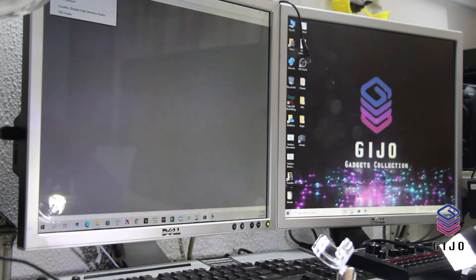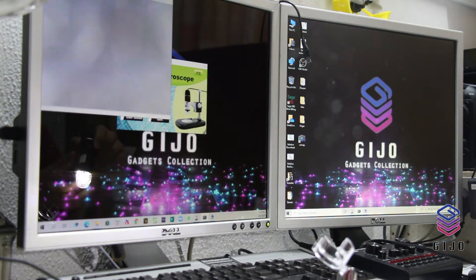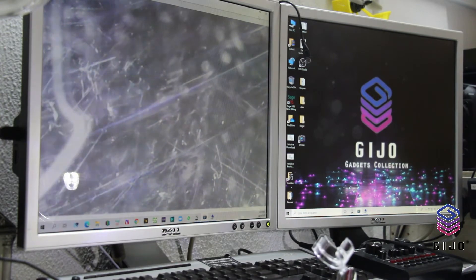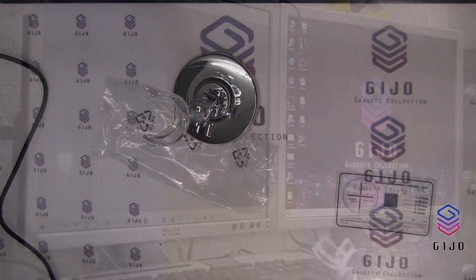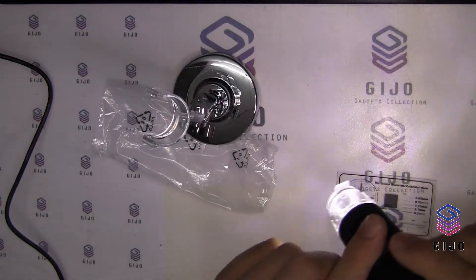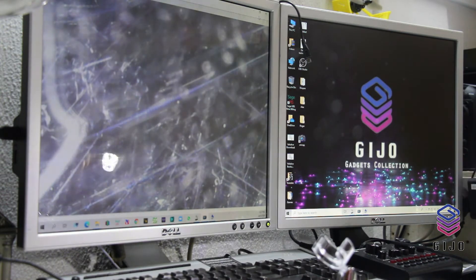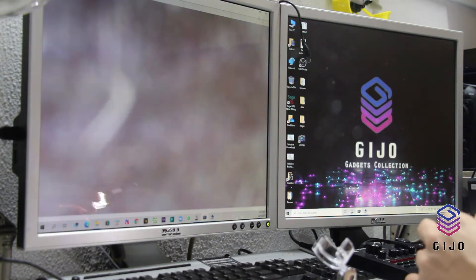USB UV-C camera device — there you are! Look at that on the screen. Wow, that's huge! What is that? There's a plastic here, I need to take it off.